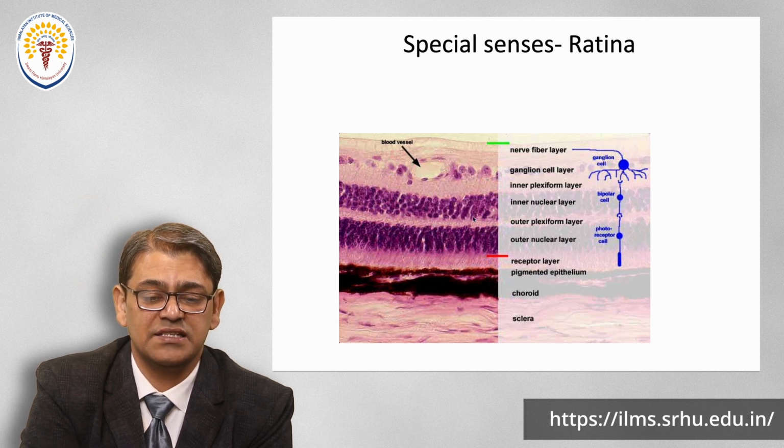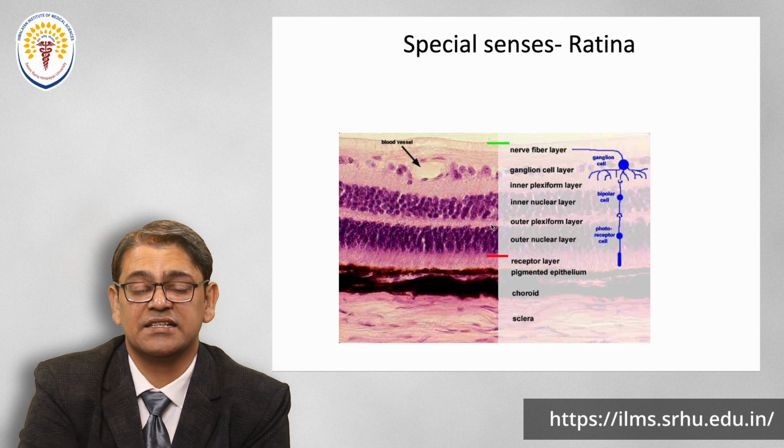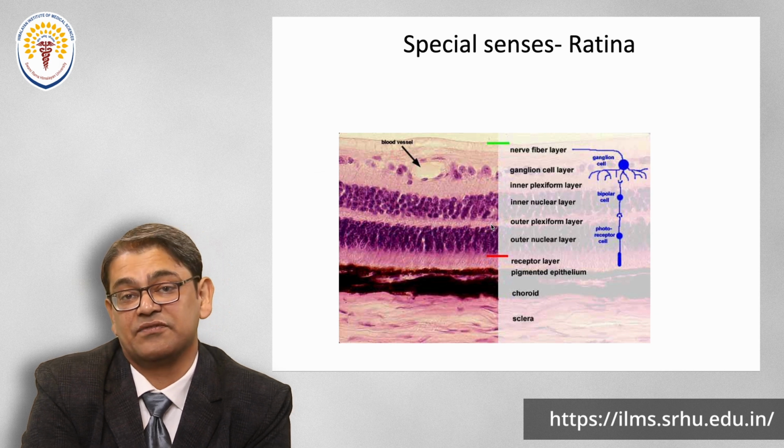After this inner nuclear layer, we again see a gap, a clear layer. But this is not really clear either. These are the various fibers intermingling with each other at this place, and this is named the outer plexiform layer.